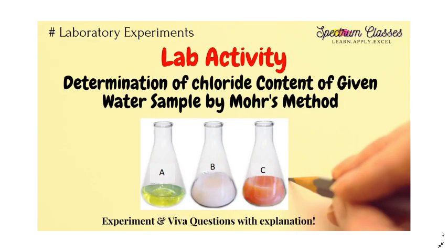Hello everyone, welcome to Spectrum Classes. This is our another lab activity video, and in this video we are going to determine the chloride content in a given water sample by using Mohr's method. So here please do not get confused with the Mohr's method and Mohr's salt.